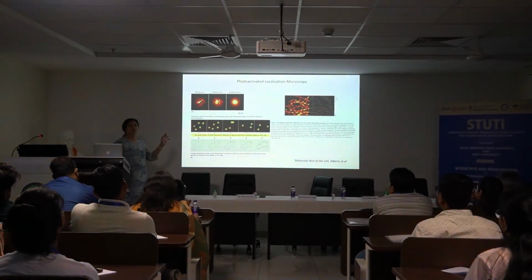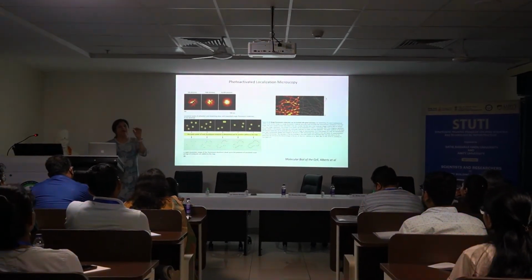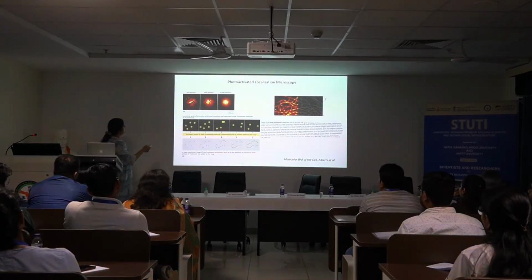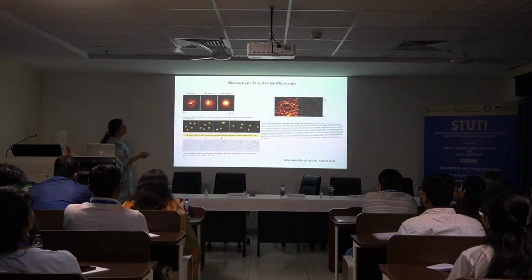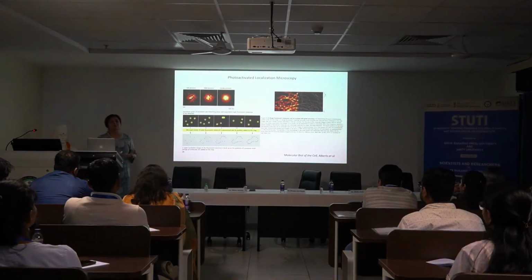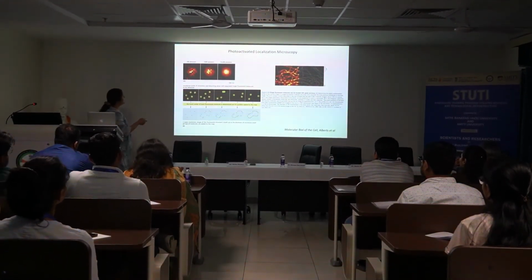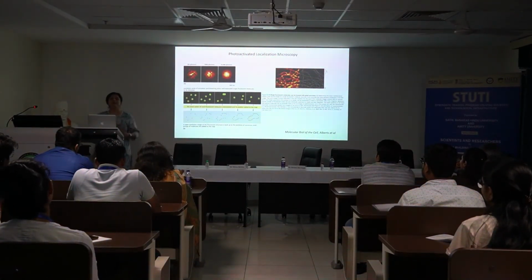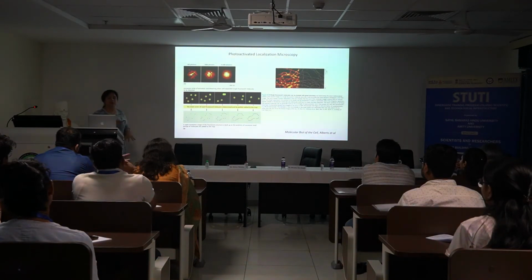This allows you to, if you use very low intensity of laser light, activate very few molecules at a time, alright? So depending upon the amount of fluorescence which is present in each of the molecules, you will see a different brightness for each of those spots, alright? So there is still a task for the field to become better and better at labeling each of those molecules, to evolve the chemistry of these molecules, for example, to have a high contrast between the dark state and the active state.